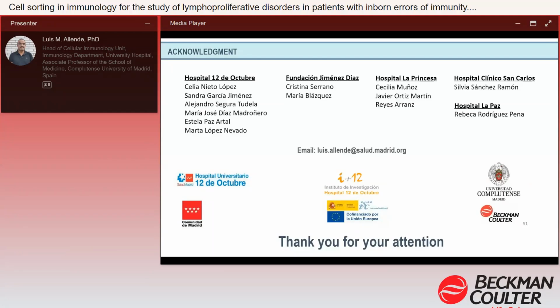My group is specialized in diseases of immune dysregulation, and for us it's important to test lymphocyte apoptosis, as you saw in the presentation, using annexin V monoclonal antibodies and propidium iodide. It's important for us to demonstrate if the patient has an apoptosis deficiency that we can correlate, for example, with a variant of unknown significance. Furthermore, if gene expression is affected, then normally we are in contact with other research groups. It is important to collaborate with highly skilled experts to design experiments to gain understanding of the role of this variant of unknown significance, and if it's involved in the pathophysiology of the disorder.